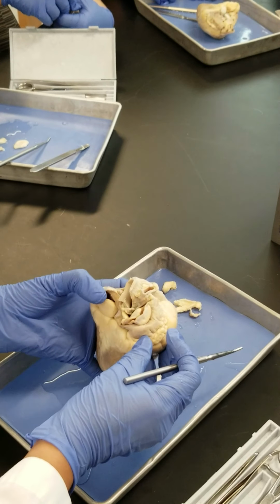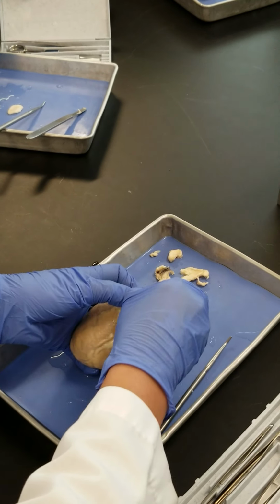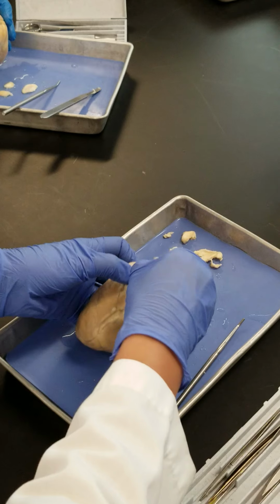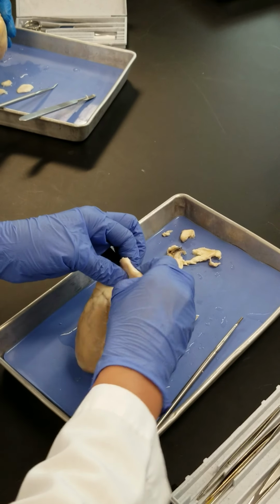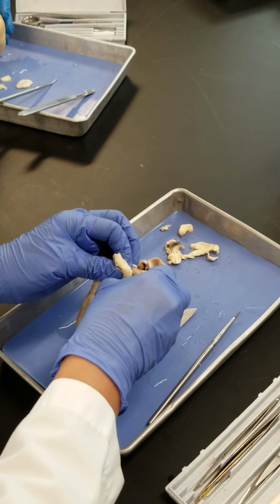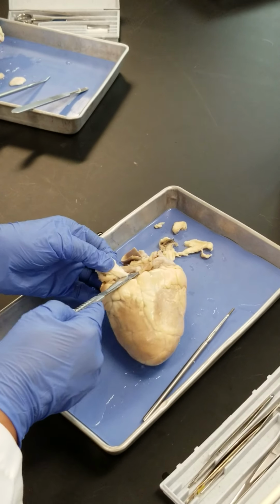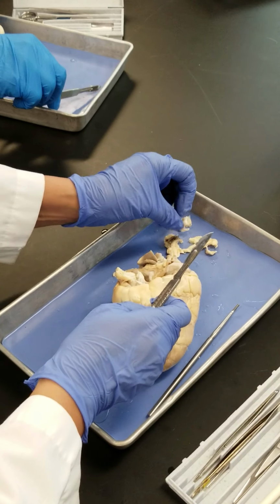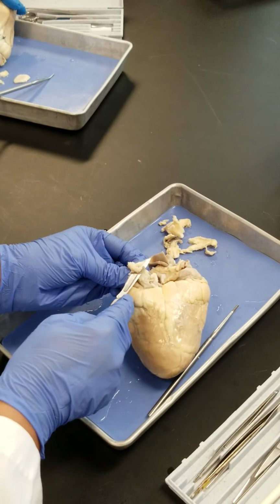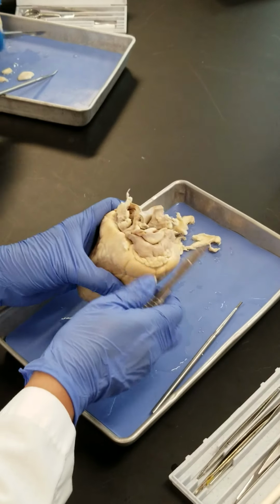So over here, as you said, we have lots of fat. I'm going to push this fat away so that you can see the wall of the atrium at least a little bit. This sheep has been very lazy. It hasn't done much exercise. They provide grass for him or her, and there's a lot of fat here. Right. We can see the outside wall.